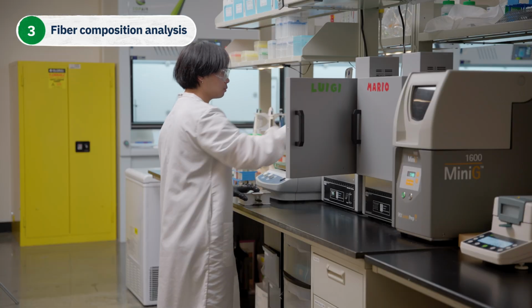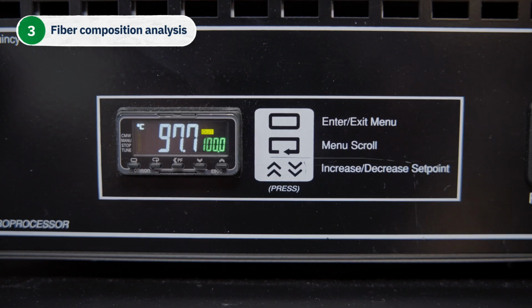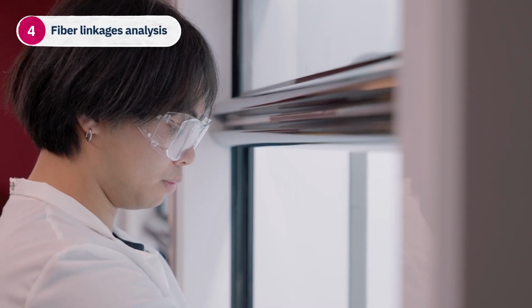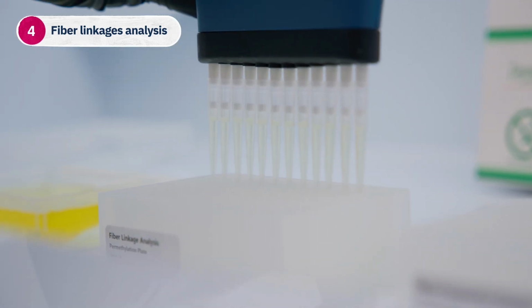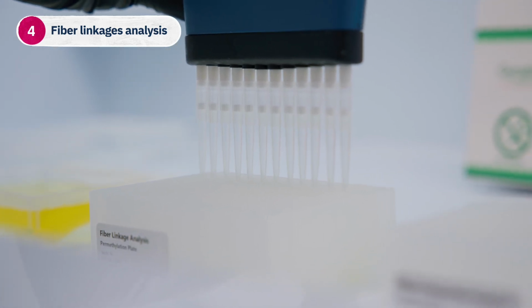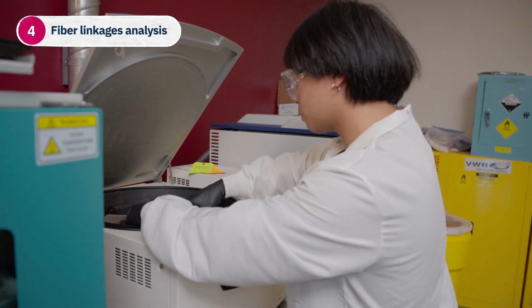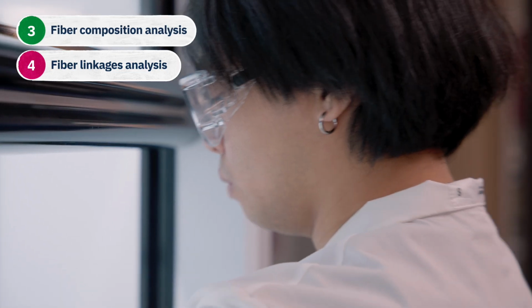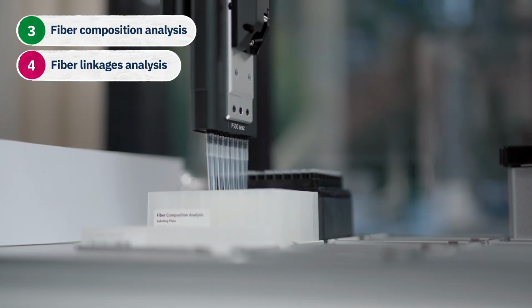The fiber composition sample undergoes enzymatic digestion. The fiber linkage sample undergoes permethylation. Subsequently, both samples undergo acid hydrolysis to depolymerize the fibers into monosaccharides, which are then labeled.